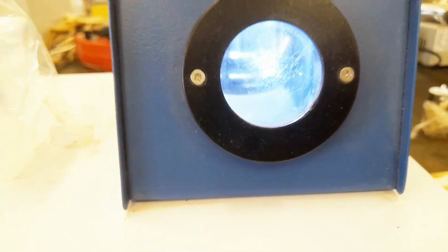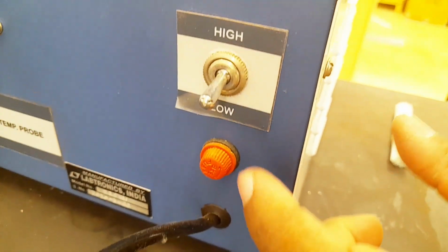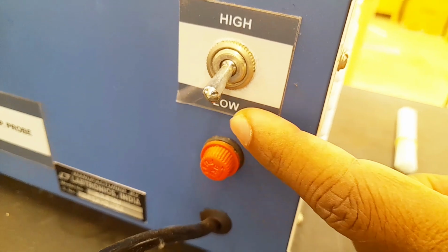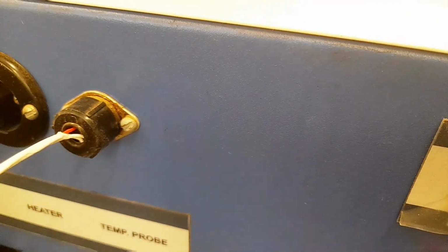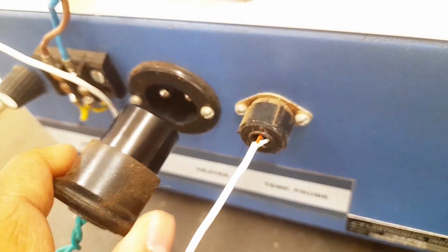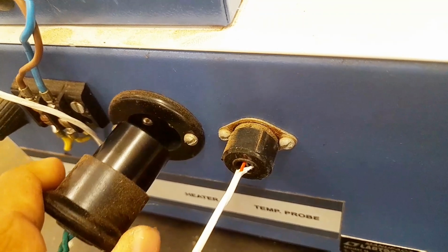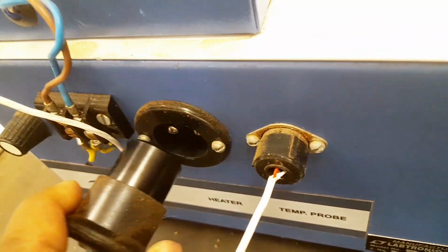In the same way, there are some other options here at the back. You can see this is the switch arrangement for high and low. Based on our requirement, we can increase this one. And there are also different attachments. You can see this is the heater. Actually this is not attached, because only once the sample is measured and the oil is filled in the chamber do we have to arrange this one. So now this is not arranged.